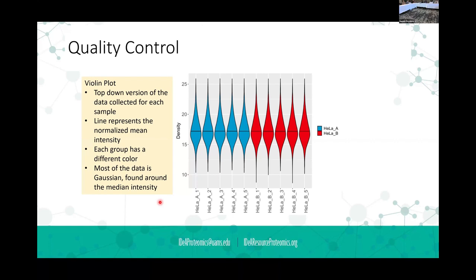Suppose I give you a sample A, same cell type. Yeah. Sample A, not treated. Sample B is treated. Yeah. So that's what he's saying. We go through 7 different types of normalization. And the one that makes sense to me is one we never use. It's the one I always used to use because it makes sense. And that's log2 normalized. You take your data and you convert it to log2 intensity, and you take the median and you set the medians equal to one another. And that is a crude way of getting to a normalization. And so that's one I can wrap my head around.